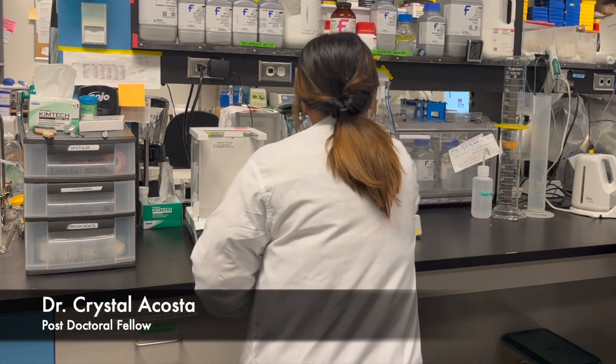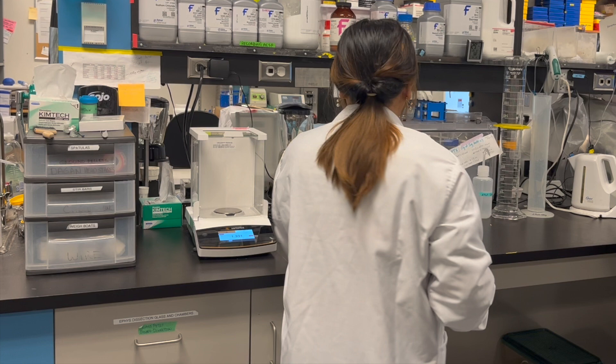Christie Labs postdoctoral fellow Dr. Crystal Acosta will demonstrate how to make this solution.